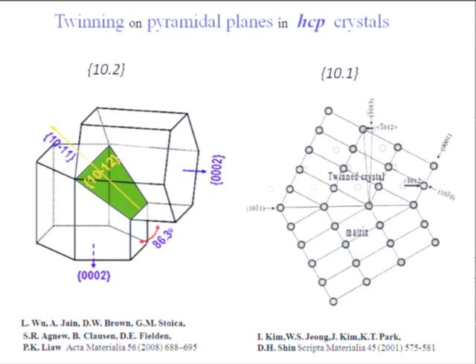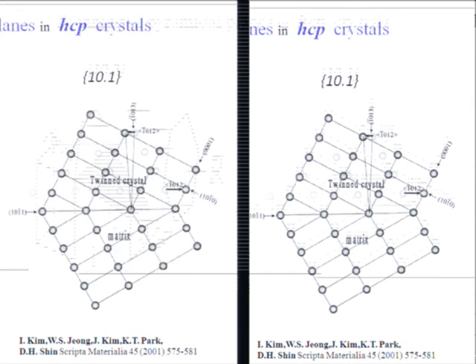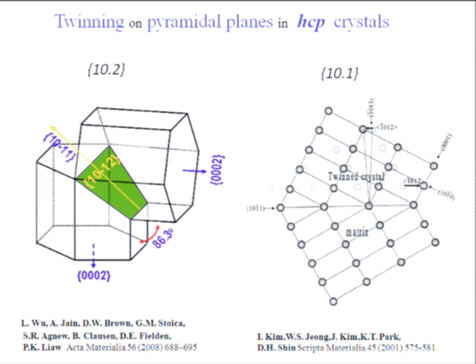This shows that this is the C-axis, which turns almost perpendicular to the mother crystal. And here again, you can observe that these diffraction spots in the matrix and in the twin crystal will never meet again, unless some very odd conditions for the C/A ratio are satisfied. And this we call non-merohedral.